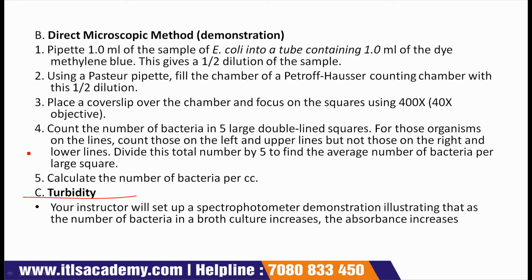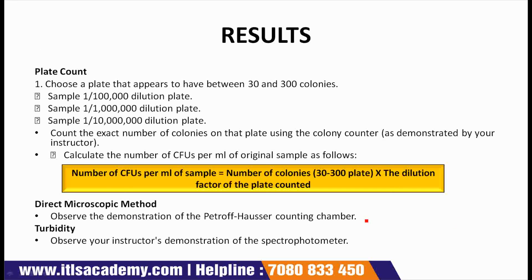Third is turbidity. Your instructor will set up a spectrophotometer demonstration illustrating that as the number of bacteria in a broth culture increases, the absorbance increases. Now come to the results.